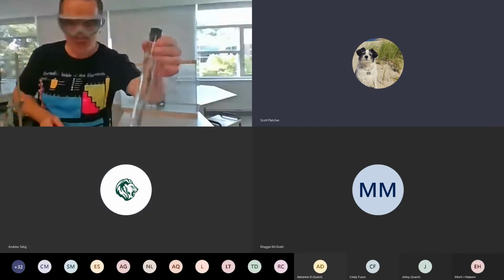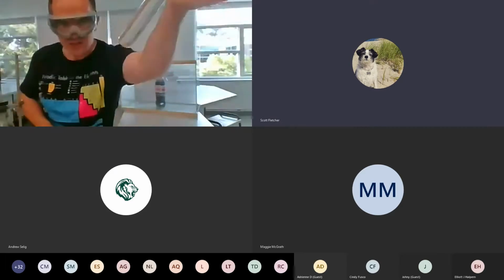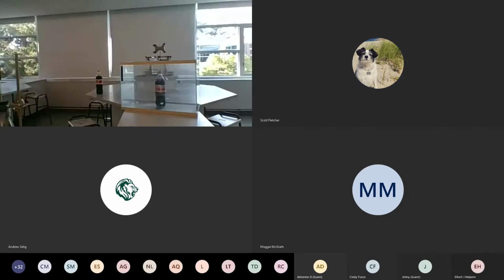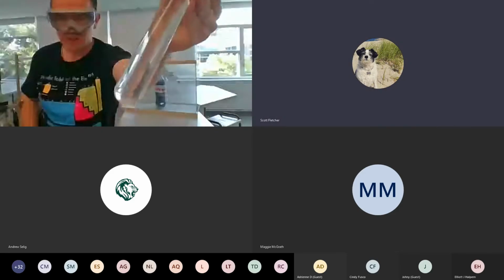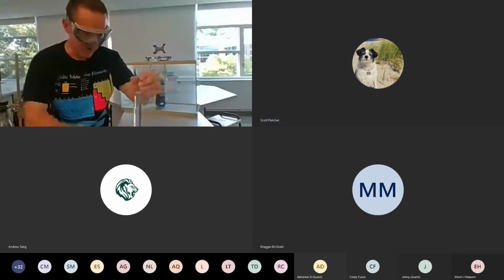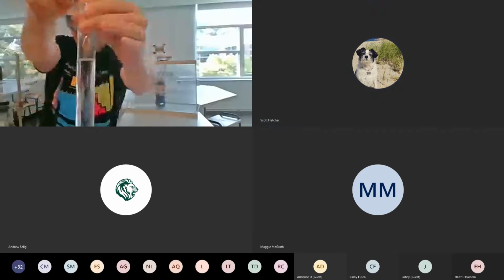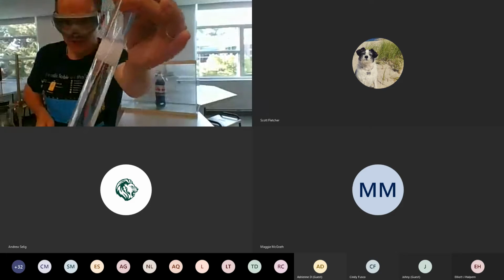Okay, so here in the test tube, I actually have a supersaturated solution. I'll bring it up close, and you can see that it's pretty clear. There's not really anything building up on the bottom, so it looks just like the other ones. Now, you'll forgive me for making you wait that long for the exciting part, because if we take a little piece of the crystal and we drop it into the supersaturated solution, see what's happening.